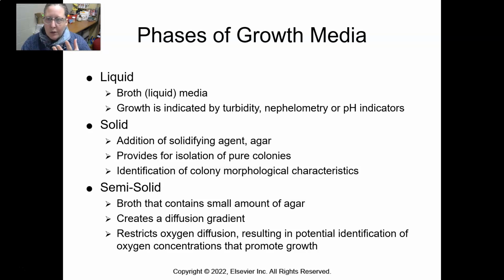And of course, the agar is kind of like the base, and on that you can put different nutrients, and you can cause different types of agar media to be made depending on what nutrients you mix with agar. Now this is not done by hand anymore. This is usually done by the manufacturer, and then they send you these plates already made.